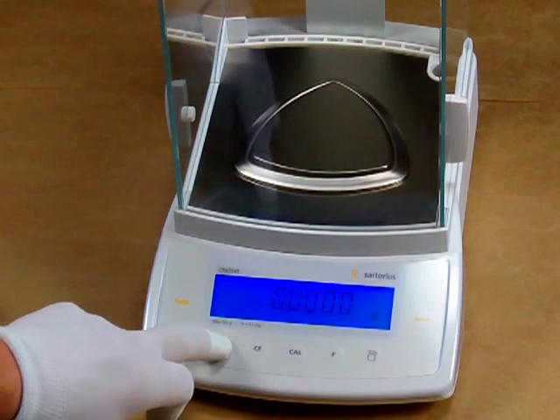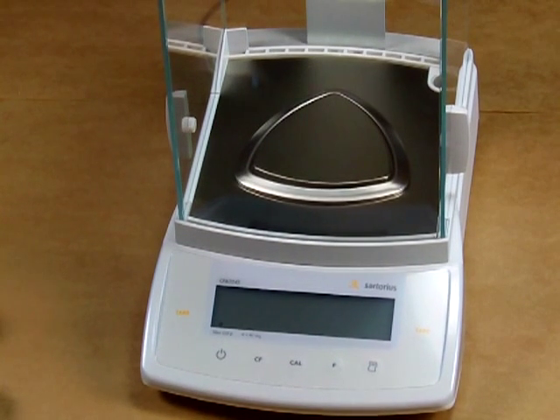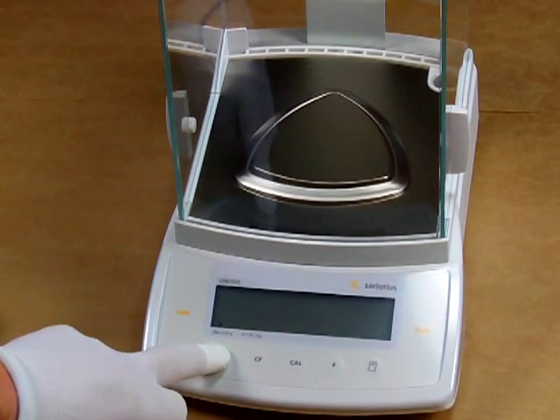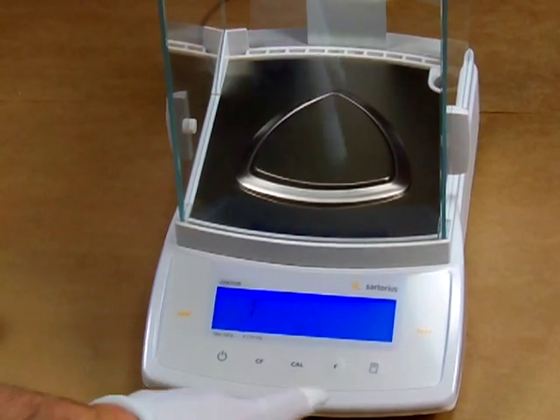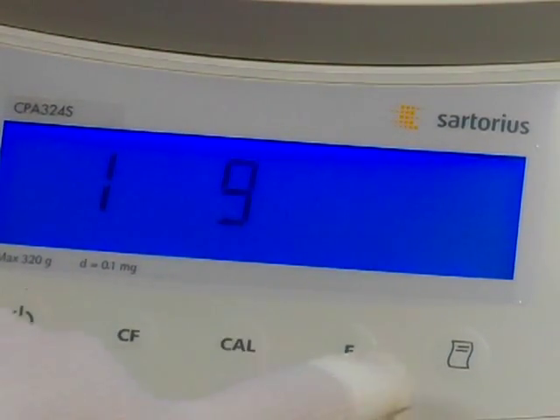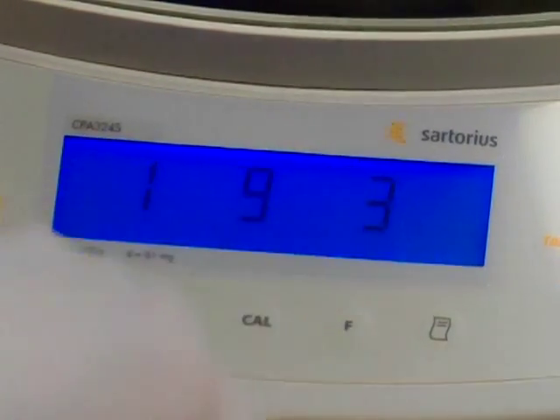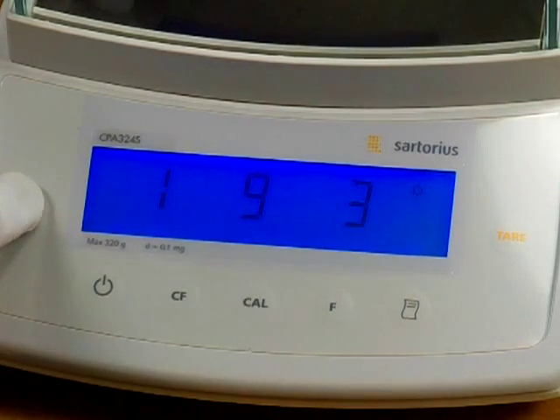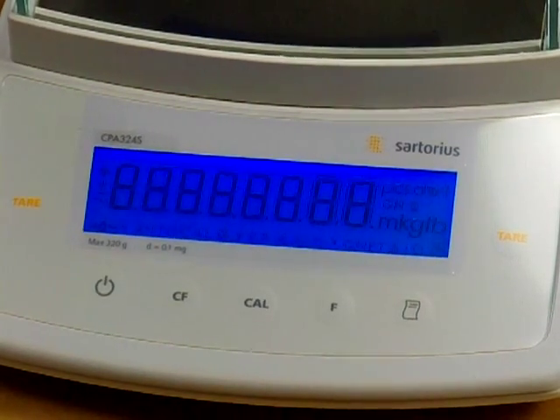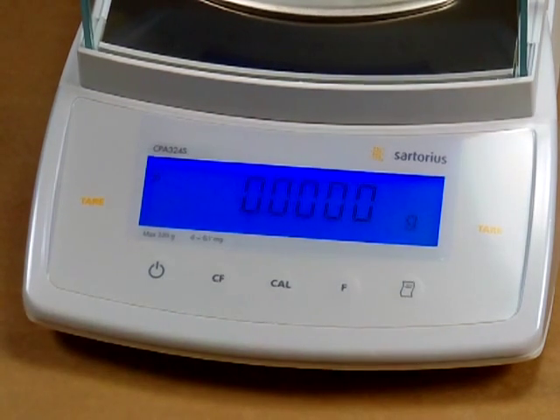Close the draft shield and power down the balance. We now have to put the balance back into internal calibration. Press the power button, then a quick press of the tare button. We need to change the menu back to 193. We're at 191, so press the Cal key to get to 193. Quick press of the tare key to store, then hold down the tare key to reset the balance with the new stored value.